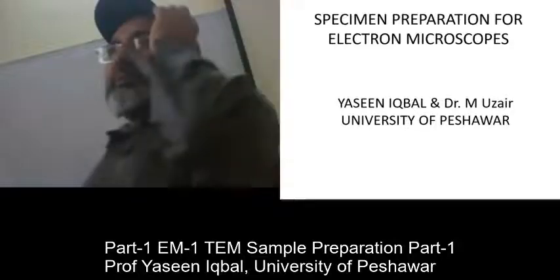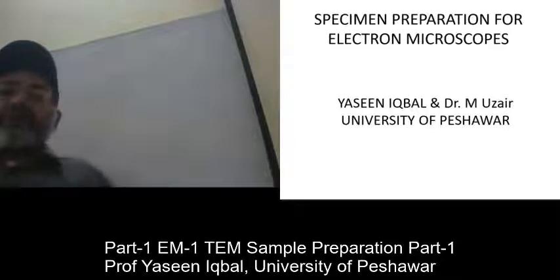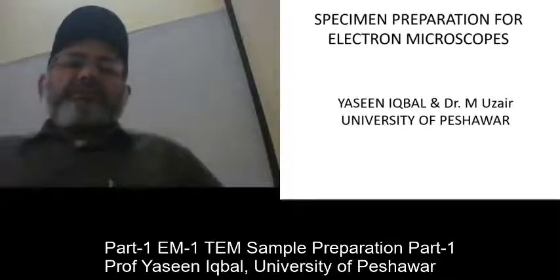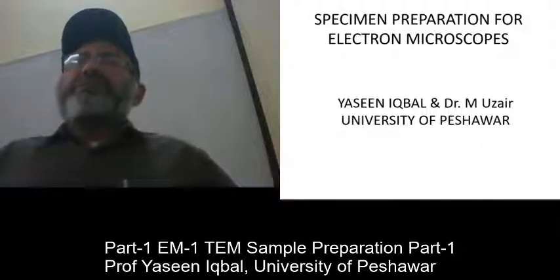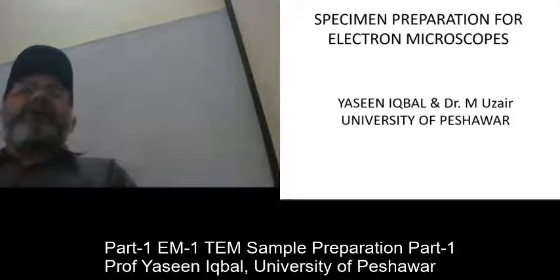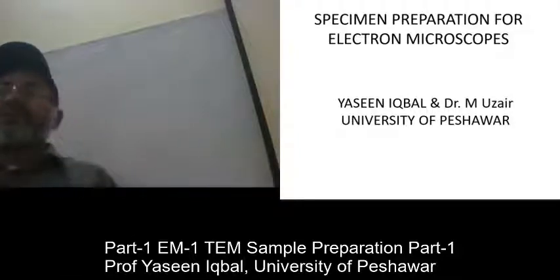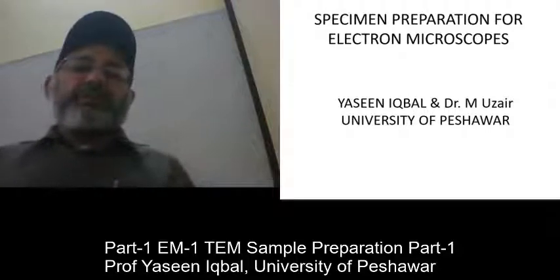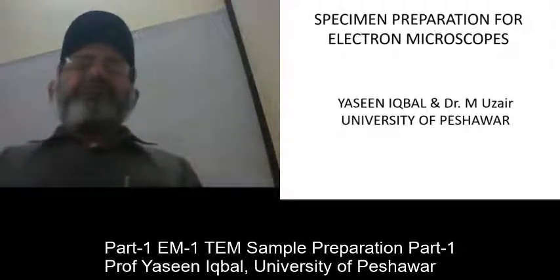Today we will be talking about the specimen preparation for transmission electron microscopy. It has been written electron microscopes, but we are focusing today on the transmission electron microscope sample preparation.